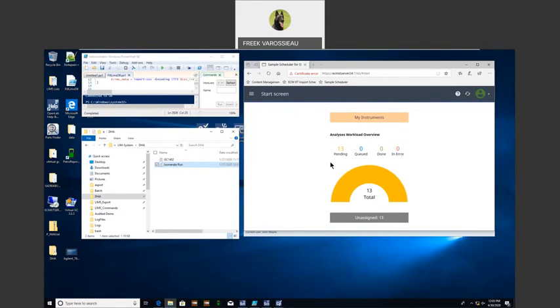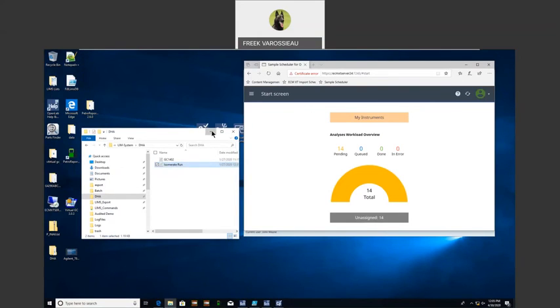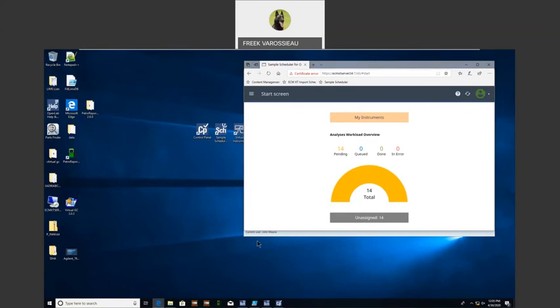done. As I already said before, I also can use my SQL statements to pull samples from the database. And for that, I need to feed my LIMS system with samples. And I can do this automatically here with a script that allows me to fill my LIMS database with samples that need to be analyzed today. So I'm quickly adding samples to my LIMS database, and that LIMS database will be pulled by the sample scheduler automatically. So let me make this smaller for you because we don't have any use for that anymore. We can already see that we have 14 samples pending in the system.